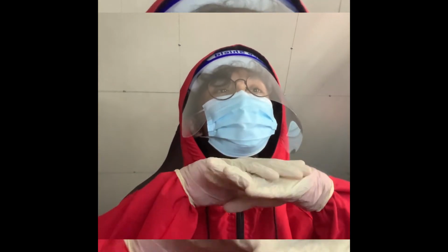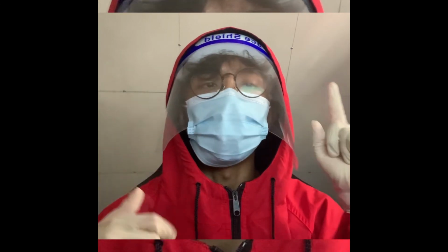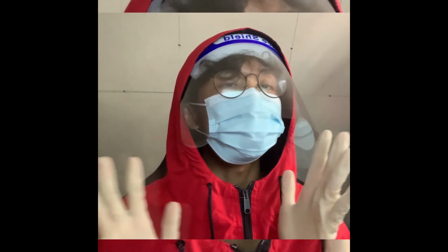Now, let's talk about gloves. Latex gloves are similar to what are being used in the biosafety level facilities. They are effective in protecting the handler from getting contaminated while in contact with contaminated surfaces. However, latex gloves have varying levels of quality, and it depends on the brand. The latex gloves used in the laboratory settings are certified to be durable and free from microscopic pores.